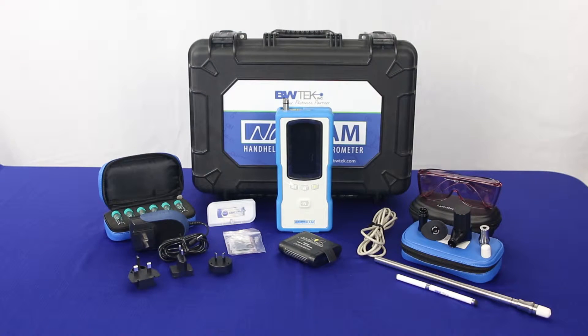Today we'll be discussing how to properly set up your NanoRam handheld Raman system out of the box.